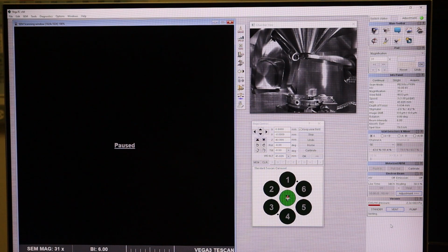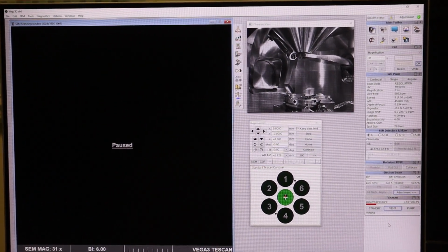So we will come back once I have removed the samples and closed the door again. See you in a bit.